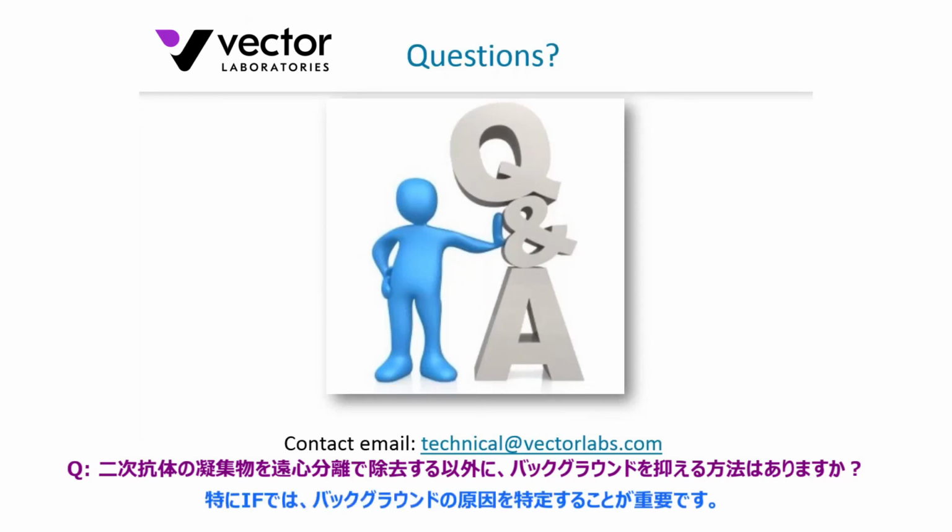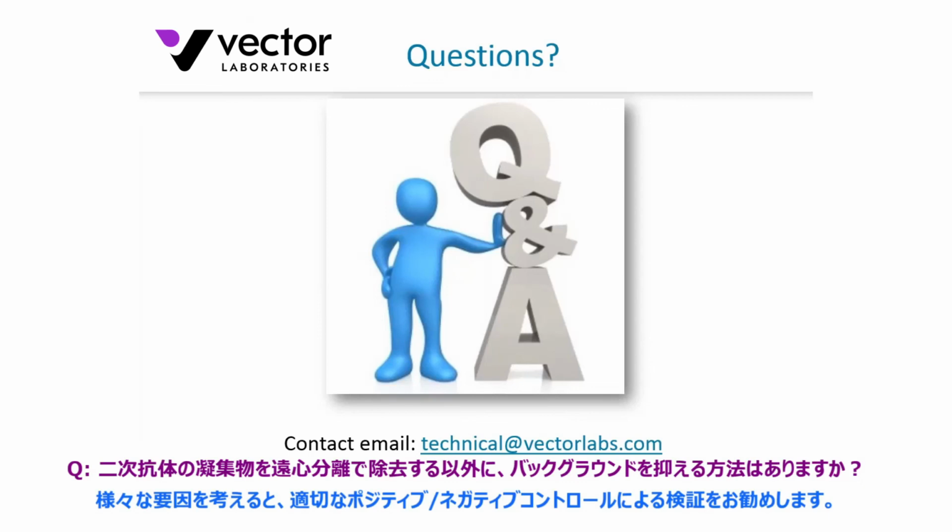So that would be of utmost importance to identify the source or sources of background if you're experiencing that in your immunofluorescent assay. It may be something as simple as diluting out the primary antibody a little further with a detergent or something like that. But nonetheless, that would be something you'd work out on some of your control material.